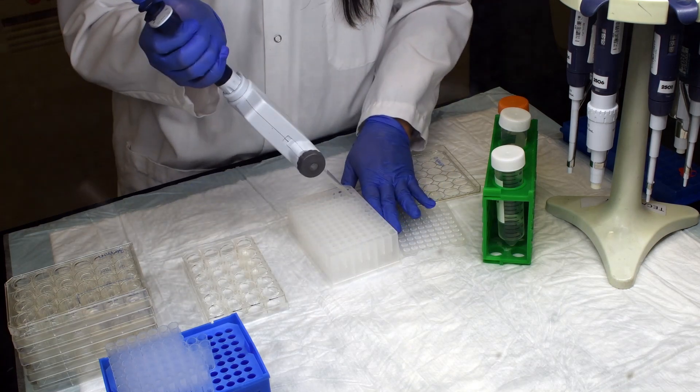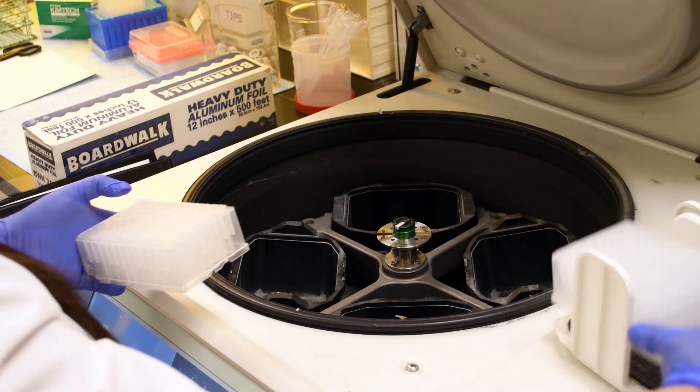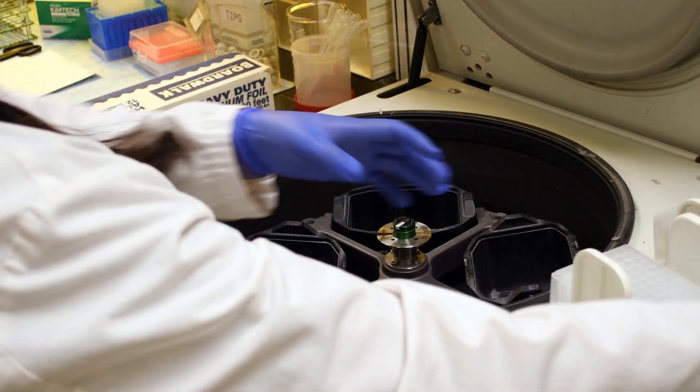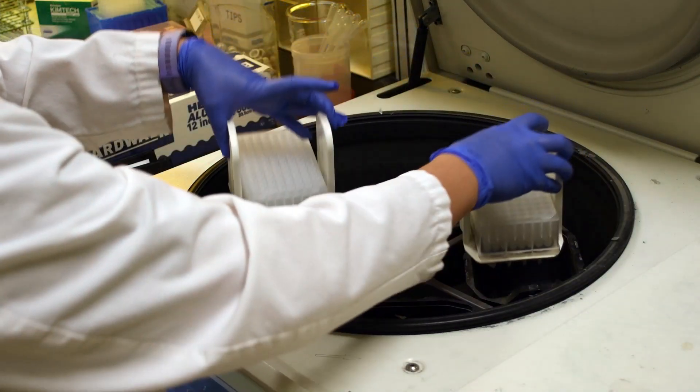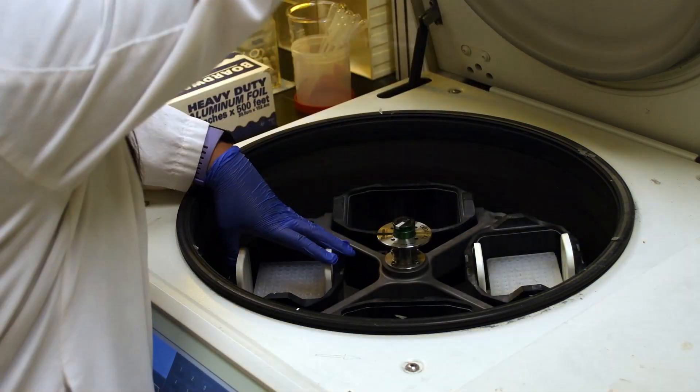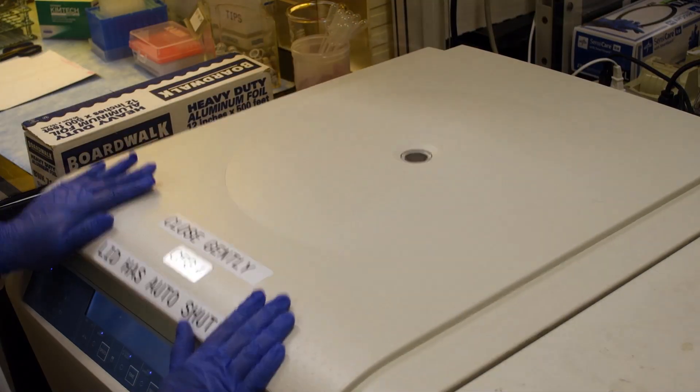Once all the samples are collected from all the time points, spin the plate at 920 times G for 10 minutes at 10 degrees Celsius. This will separate protein that precipitated during the cell lysis and allow for a clean transfer of solubilized sample for analysis.